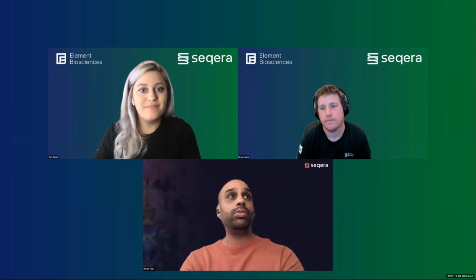So before you start writing a pipeline, you'd need to ideally have some background knowledge of Nextflow and what it can do and that sort of thing. There are tons of training courses, both recorded and also in the future that are being run by the community. And at Seqera, we also run these training courses for our customers as well. So first of all, I guess it's learning Nextflow to some sort of intermediate level of knowledge. And then really it's breaking the problem down in terms of what you're trying to achieve.